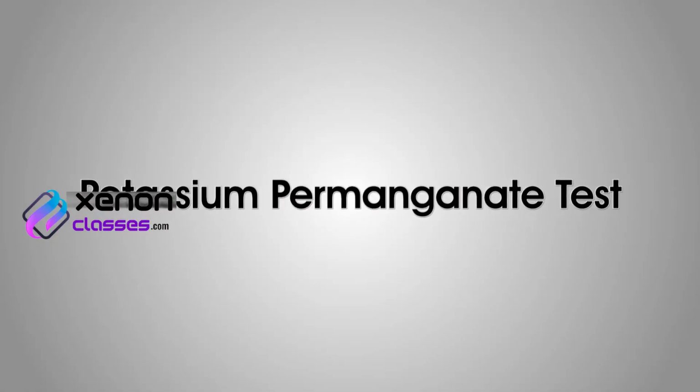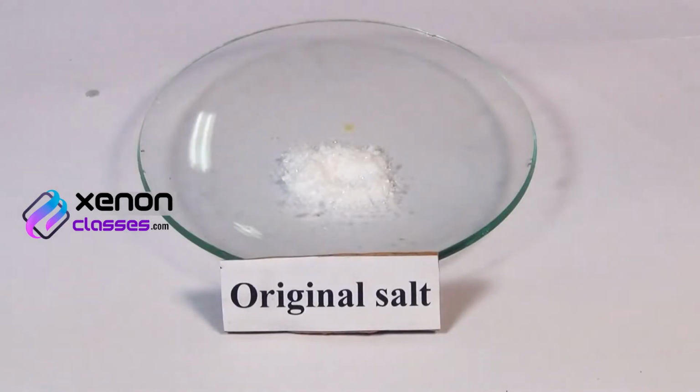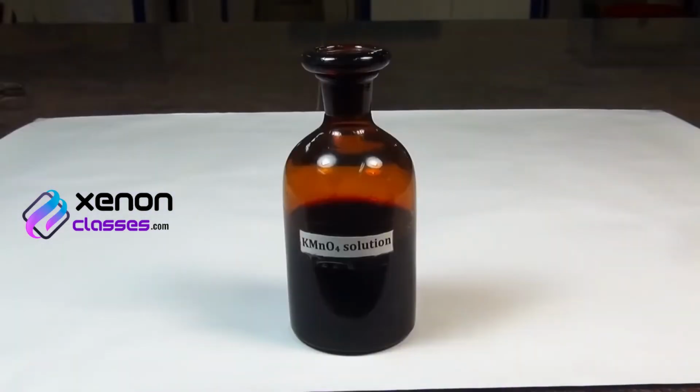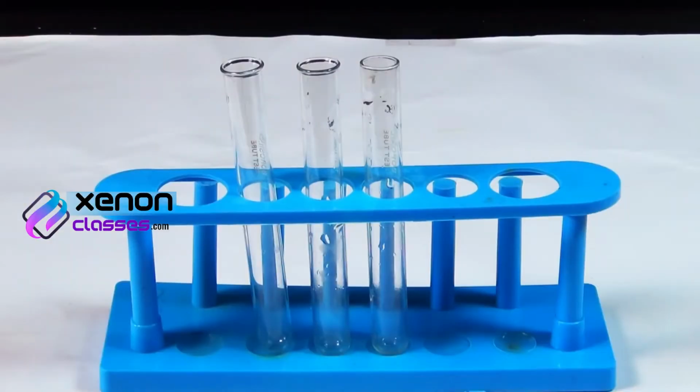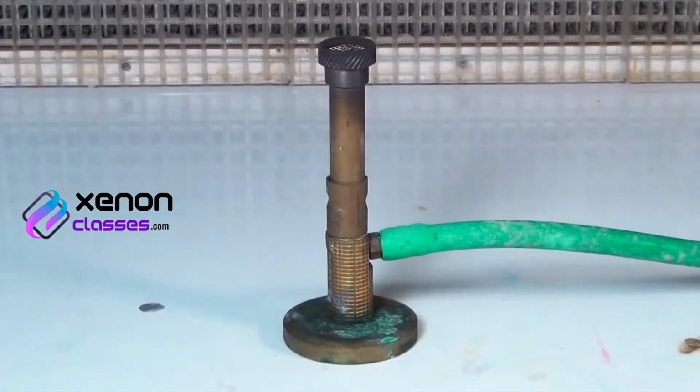Potassium permanganate test. Materials required: original salt, dilute sulfuric acid, potassium permanganate solution, test tube holder, droppers, and Bunsen burner.